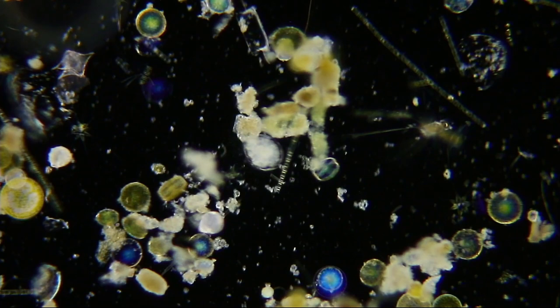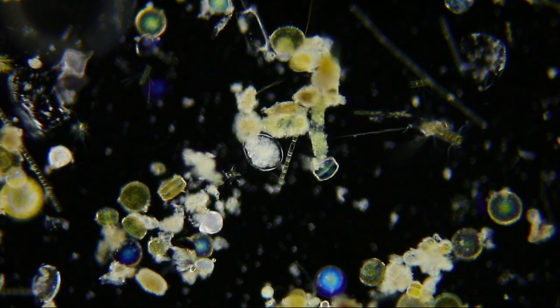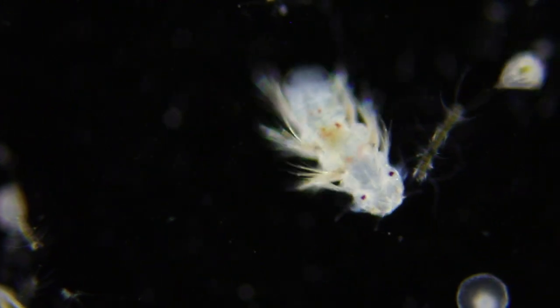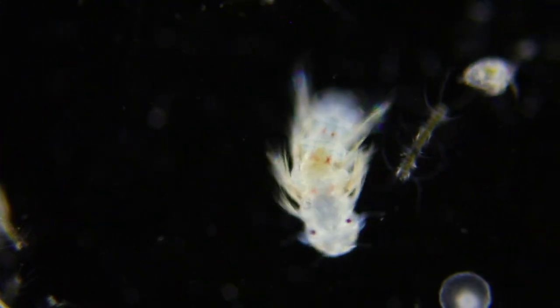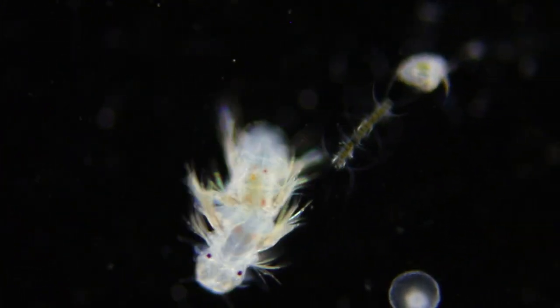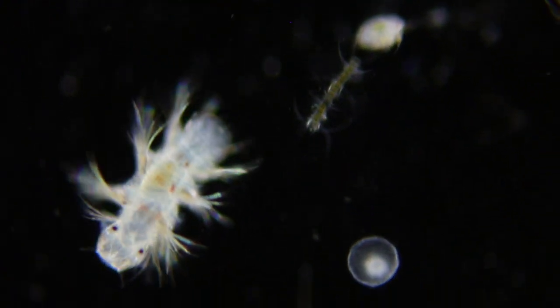The phytoplankton are the plant-like plankton that many of the zooplankton feed on. Highlights in the zooplankton this week include this polychaete worm larva. Notice the segments and bristles.